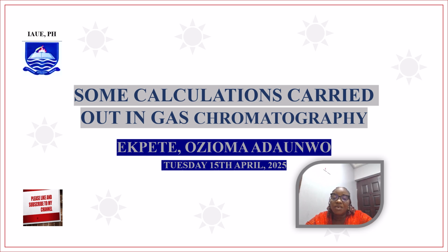Today we'll be looking at some calculations carried out in gas chromatography.